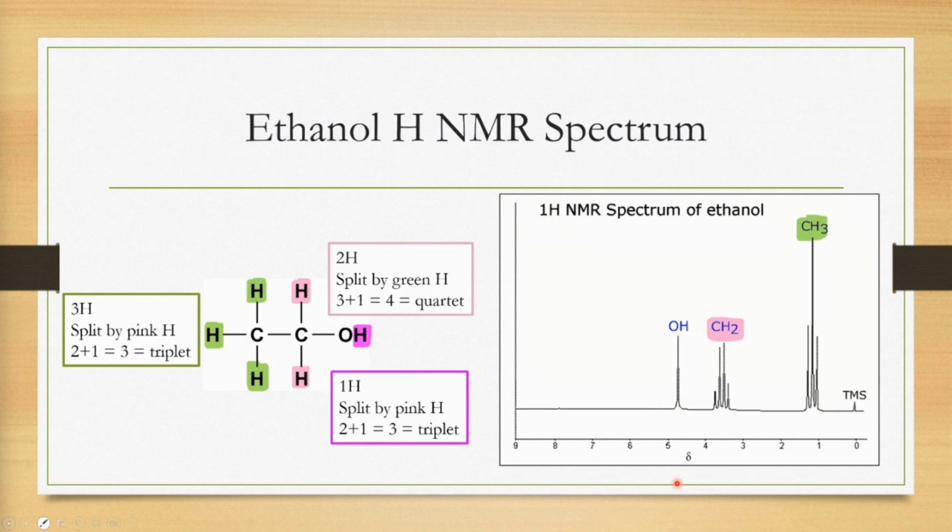We can talk about what we'd expect in theory and what is actually observed in an NMR spectrum, because there are limits to what an NMR spectrum can resolve. Anyways, we see this as the OH peak.